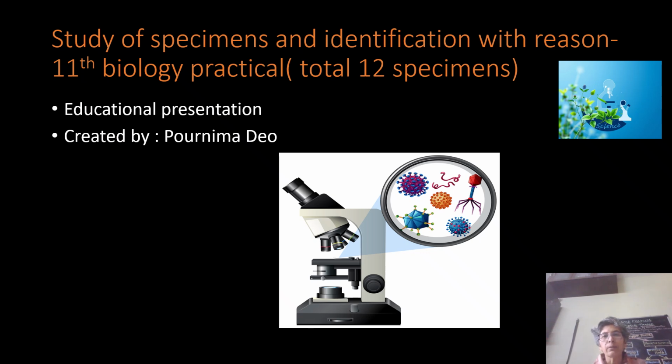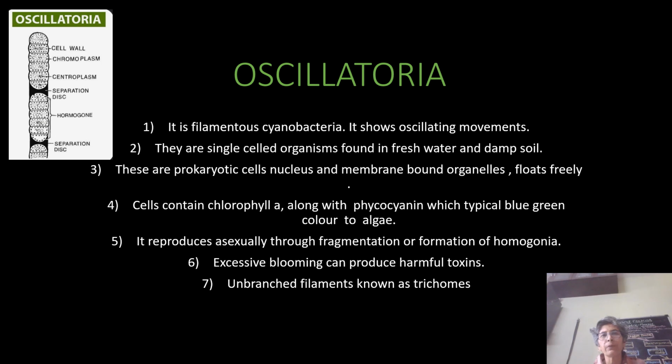There are 12 slides or 12 specimens. I have given the diagram for each. The diagrams are labelled diagrams and I have given features also. These are useful for your practicals and for writing features in your journal.